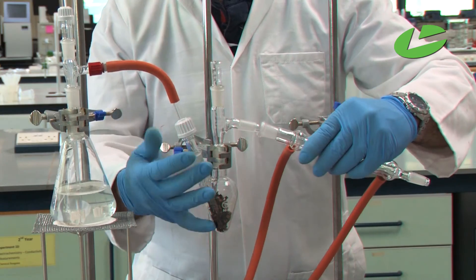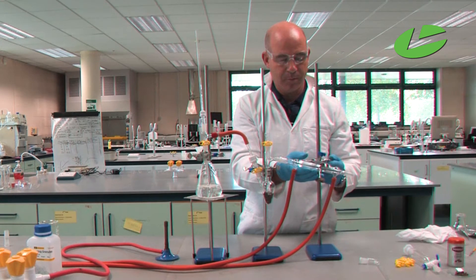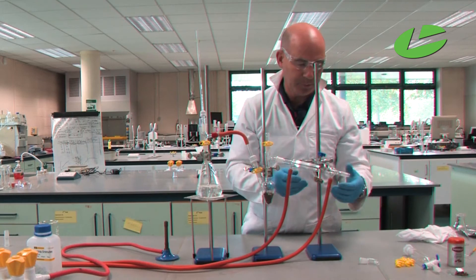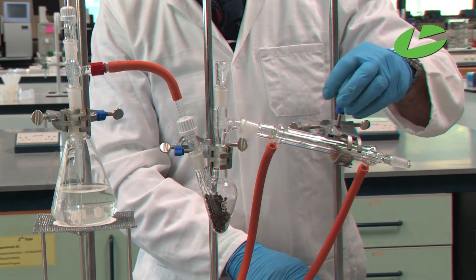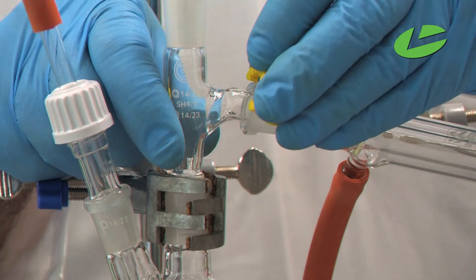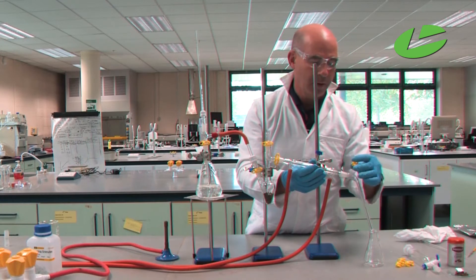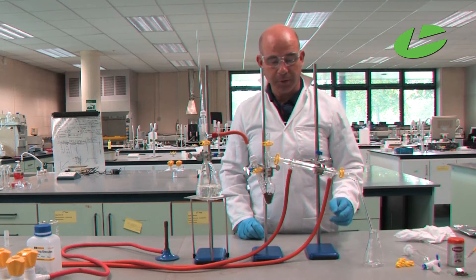Put the condenser in place — notice the water is going in at the bottom of the condenser and out at the top. BB clip that to secure it, then add the drip arm on the conical flask to receive the clove oil. The reaction is now ready to go.